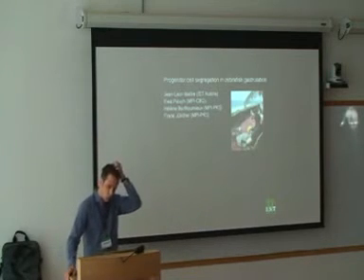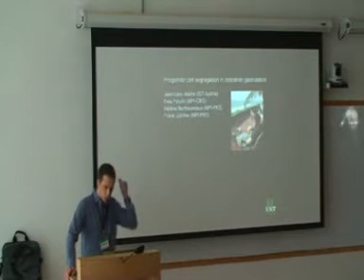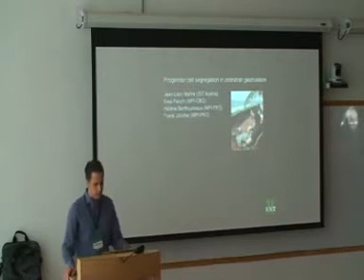Okay, so what I will do in the next 45 minutes is give you a little bit of developmental biology introduction at the beginning, and then I will show you what we have done to analyze cell properties which lead to their sorting behavior, and how we have used micropipettes in this process. Okay, so I will speak about progenitor cell segregation in zebrafish gastrulation.